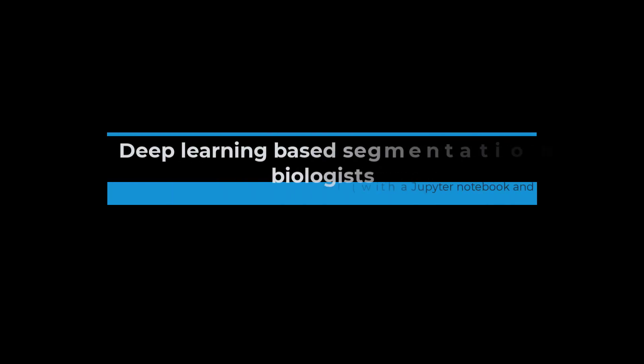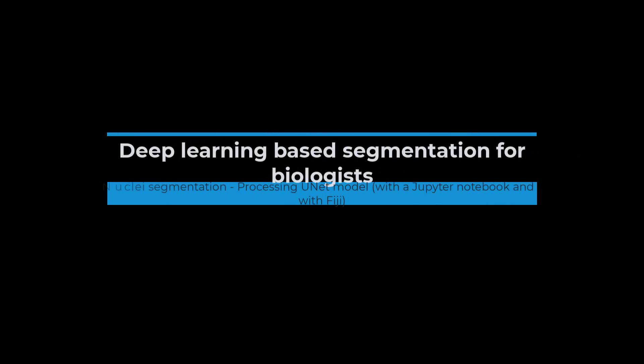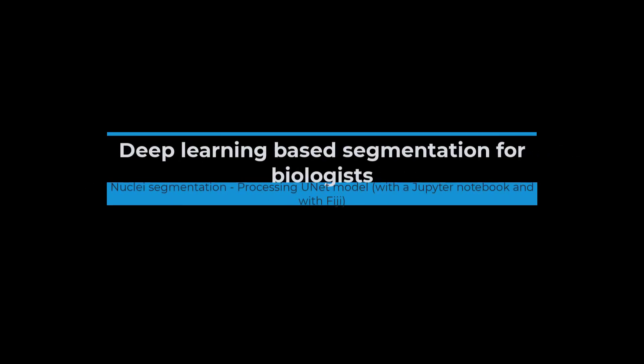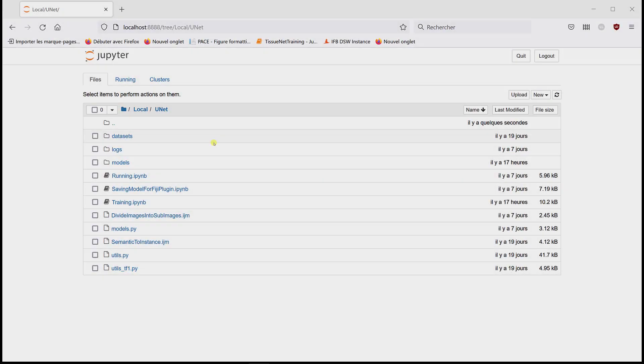In this video, I'm going to show you how you can use your trained U-Net model to segment the nuclei, and then how we can save a model to be run in Fiji as well.